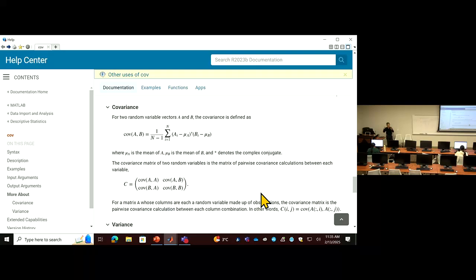In single cell data, if we consider cells as samples, then the genes will be the variables that define the properties of cells. So covariance in our language will define the relationship between genes.